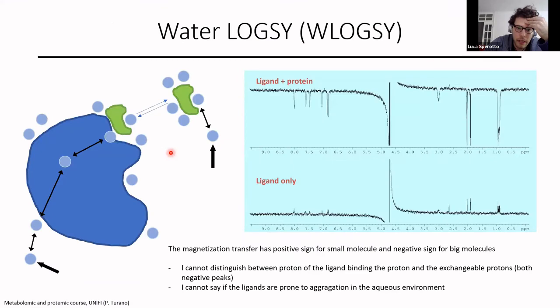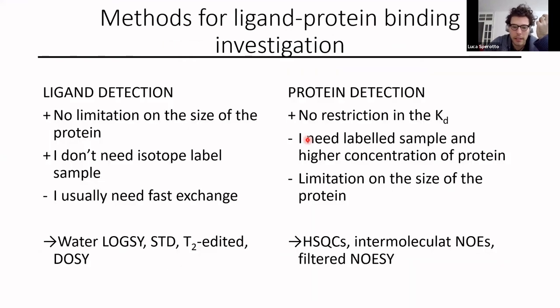So one is the WaterLOGSY. It's called that because it's based on the excitation of the water. Basically, you just collect two different spectra. I forgot to say that more or less all these experiments here are 1D spectra, and that's why they are also suitable for, let's say, high throughput screening.